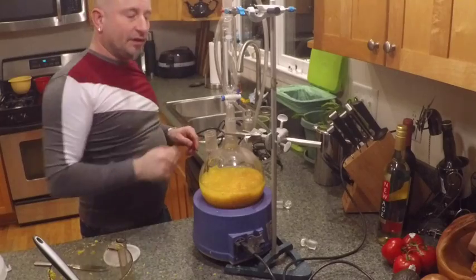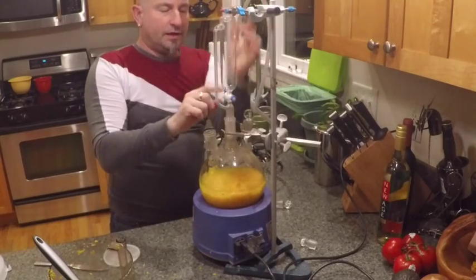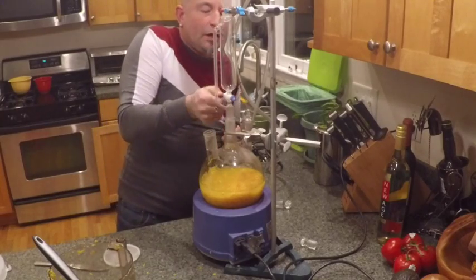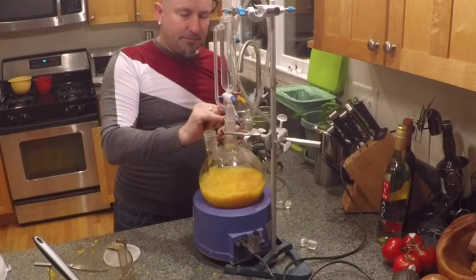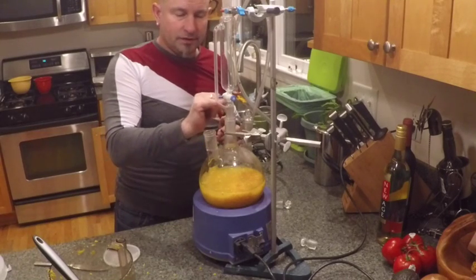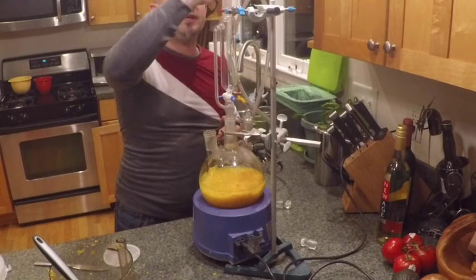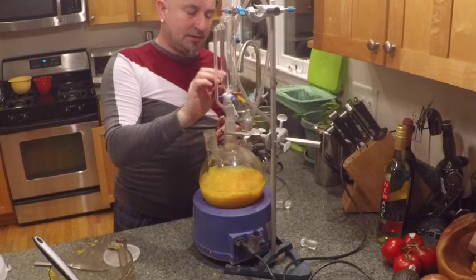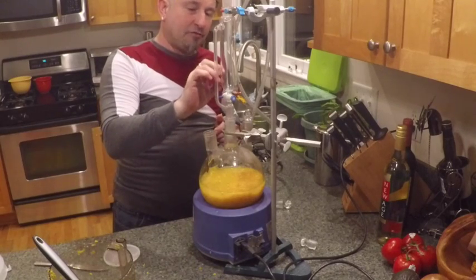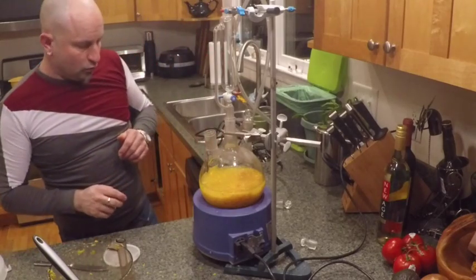Let's get some water in the condenser. What we have here is an addition funnel — I'm going to close the valve. What will happen is the steam and oil carried by the steam will rise up here, go into the condenser, condense, and then come back into the addition funnel. After a period of time you'll see the oil separate out from the warm liquid.